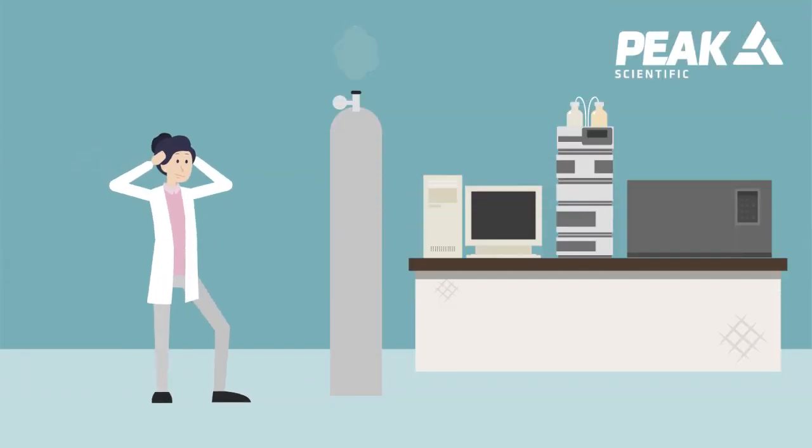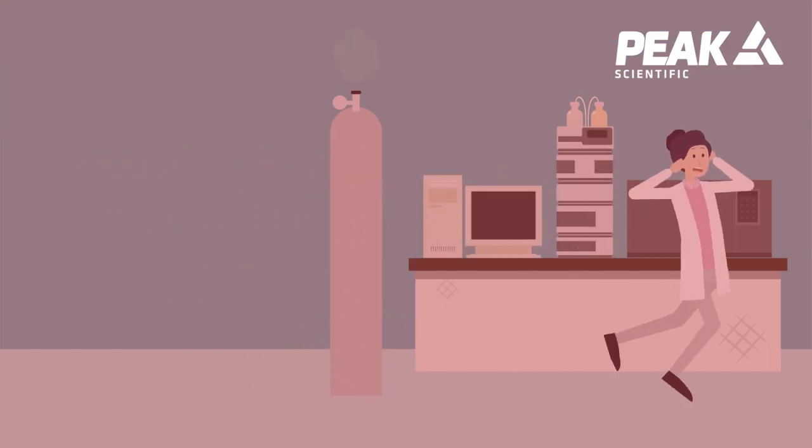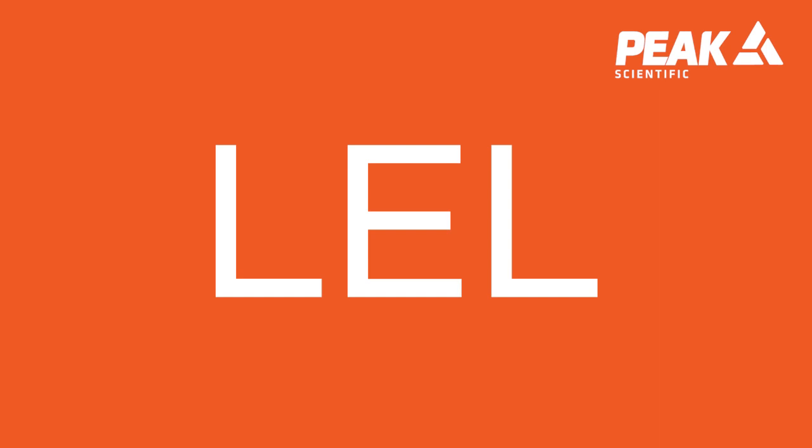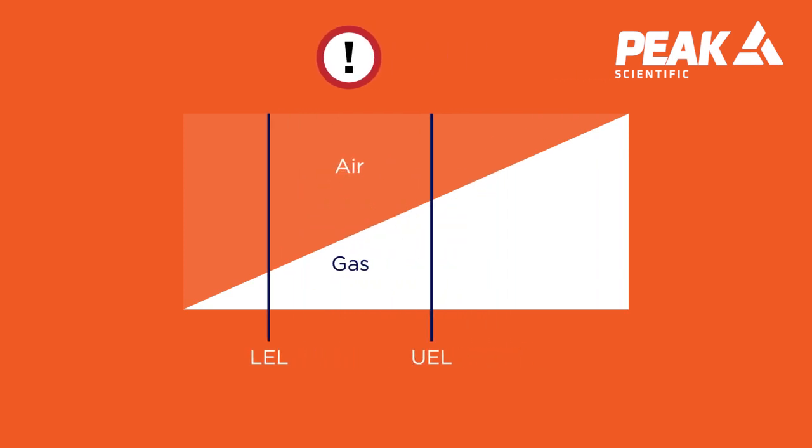If your hydrogen gas cylinder develops a leak this can extremely quickly fill your lab with explosive gas which risks reaching the lower explosive limit or the LEL. The LEL is the lowest concentration of a gas or vapor that will burn or explode if ignited and it can vary from gas to gas.